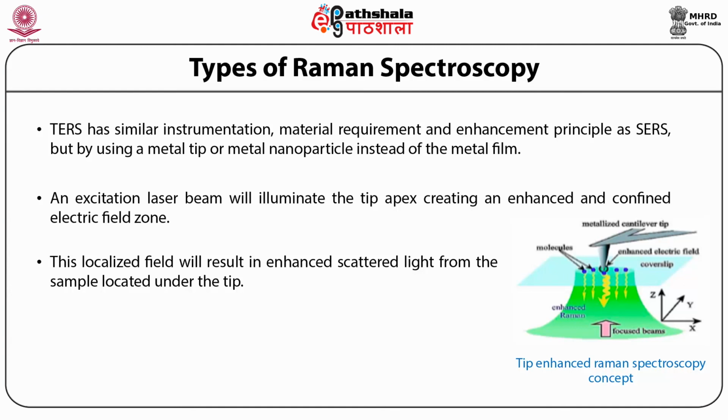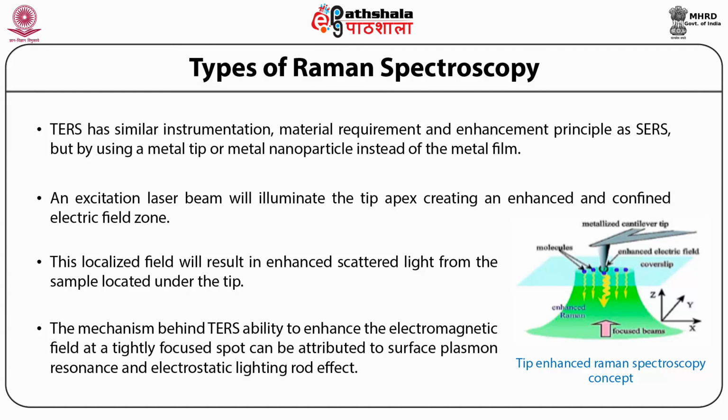A diagram of the TERS concept can be seen in figure 3. The mechanism behind TERS's ability to enhance the electromagnetic field at a tightly focused spot can be attributed to surface plasmon resonance and the electrostatic lightning rod effect. Figure 3 shows the tip enhanced Raman spectroscopy concept.